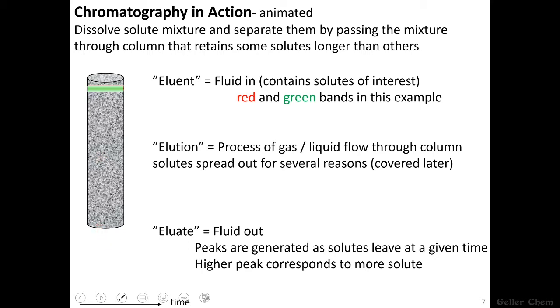And the whole time we're keeping track of how much time has passed. And time is what's actually plotted on the x-axis of our data. We just keep track of how much time has passed and when chemicals start being detected. So let's see this in action.